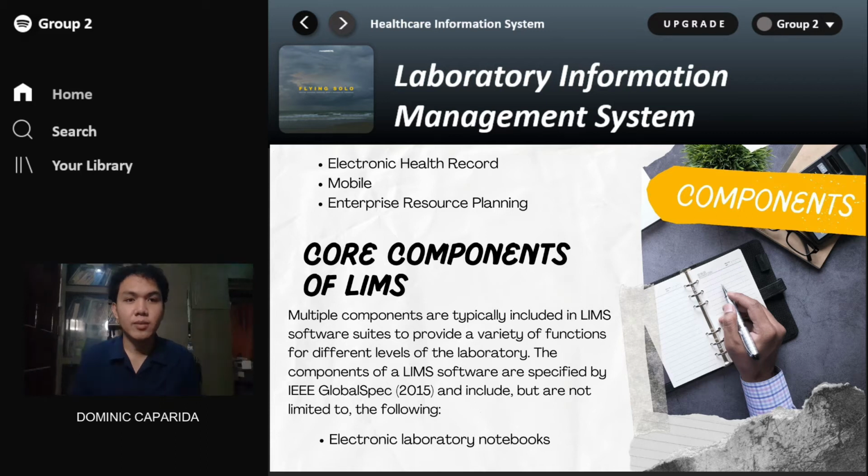LIMS softwares. So here's an example situation. Consider a lab where different researchers track samples in different ways, using everything from a traditional means like a paper and a pen to a massive spreadsheet. It will be difficult to ensure that the data isn't tainted by a human error.